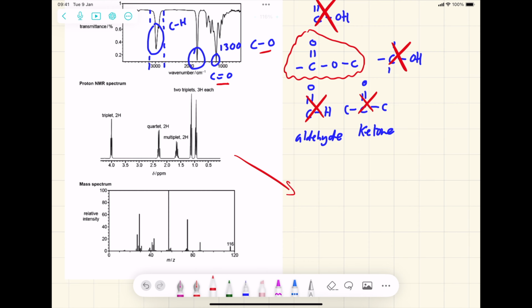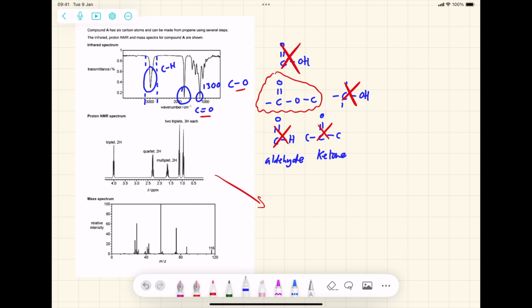If you look at the NMR spectra, we can see there are 5 distinct peaks. So in my NMR video, I describe the 3 basic rules for both proton and carbon NMR, which I will briefly repeat here, which is number 1, the number of peaks is equal to the number of distinct environments.